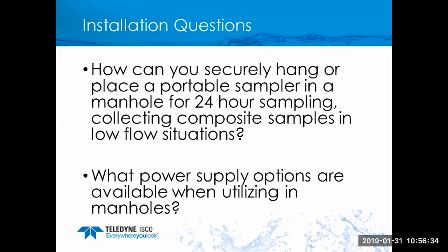All of those situations are examples that will defeat and work against the liquid detector. If you were to keep the liquid detector active, you would get pretty much a bevy of errors being reported, and you may have a lot of variance and inaccurate sample collection.